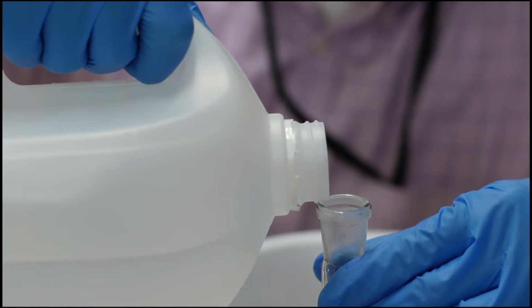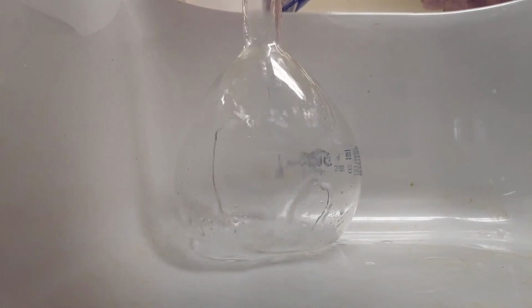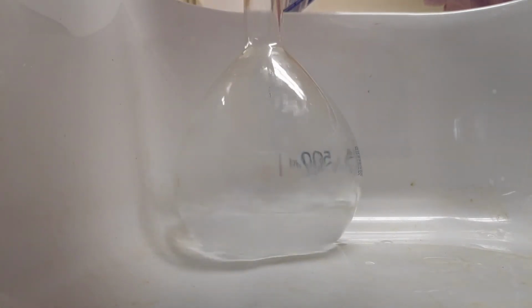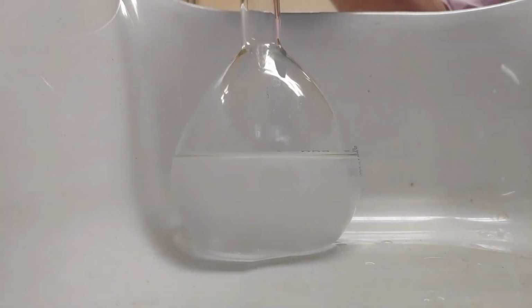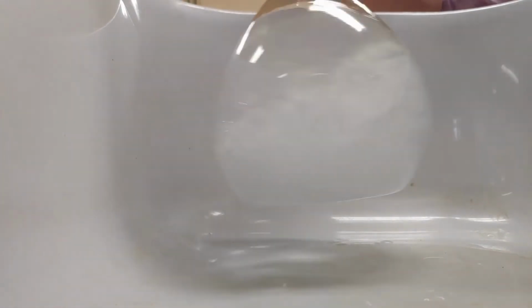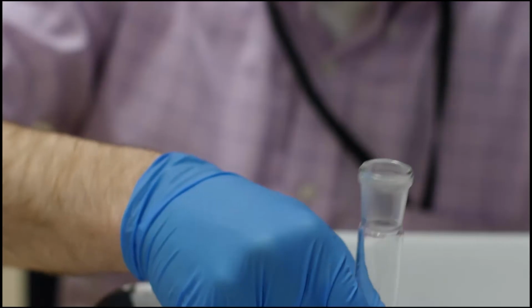Deionized water is added to the flask until it is about half full. The solution in the flask is swirled until the potassium iodide is completely dissolved.